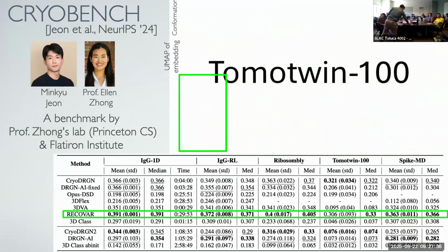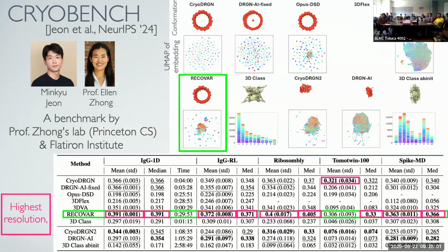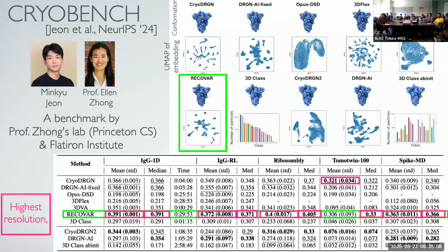What they find is that the best performing method is ours in almost every case, across almost every metric, which is quite remarkable, because once again, our method is just doing PCA followed by some clever averaging. And a lot of the methods here are deep learning methods, which might use very intricate structural priors, or physics priors, or biological priors. And yet very consistently, just PCA plus averaging will outperform all of them, which is pretty remarkable.